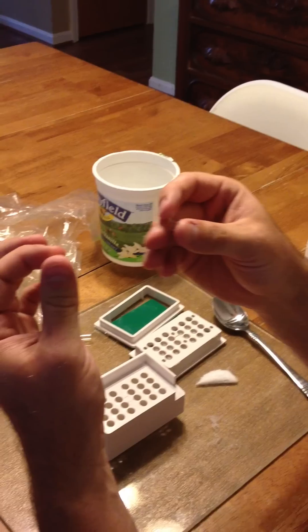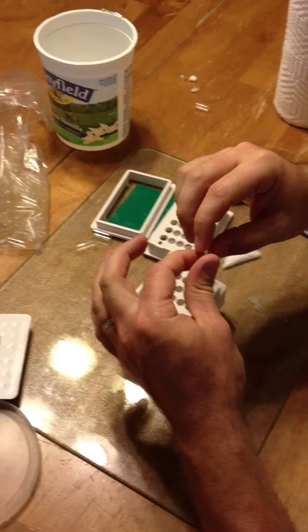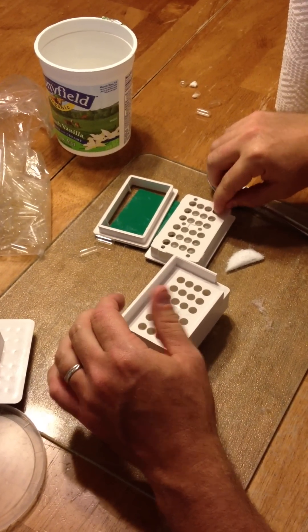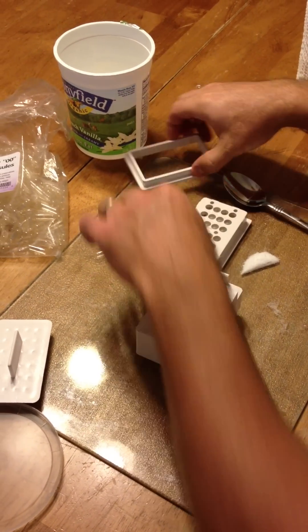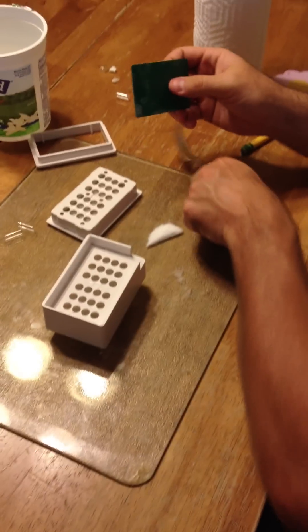What you do is you cap it open like this, and then you put them in this little tray like that with the top right here. Obviously I have done all that already.